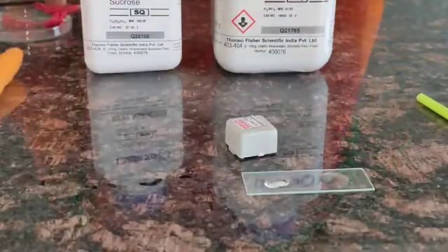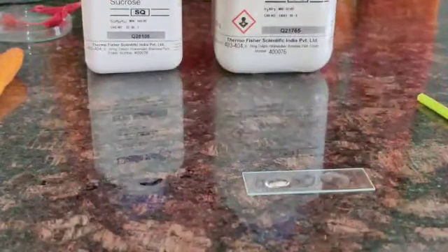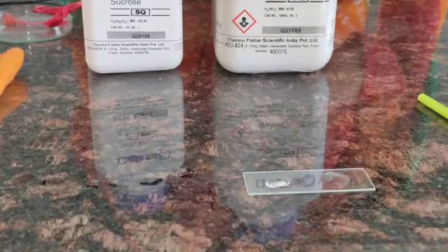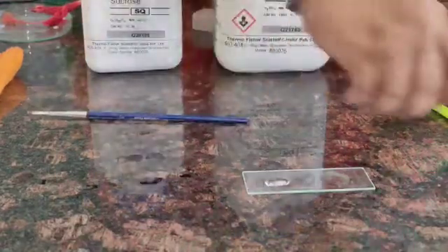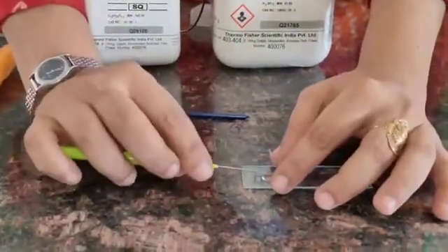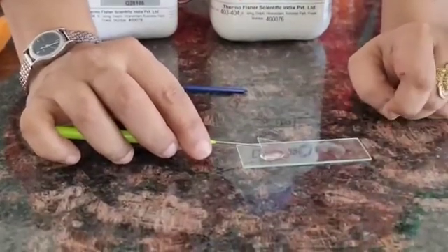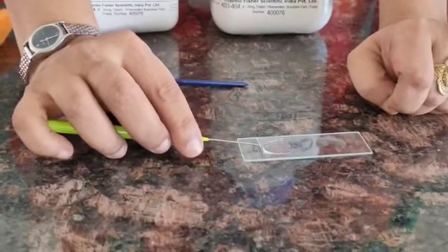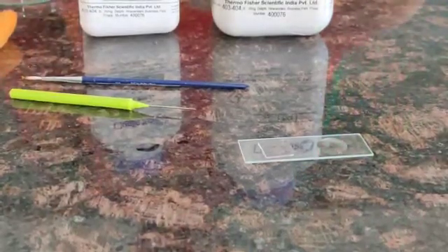Gently we dust the pollen grains. Then we place the cover slip over the nutrient medium at an angle of 45 degrees, gently placing it so that there are no air bubbles. With the help of the needle, we place the cover slip over the nutrient medium on the slide.